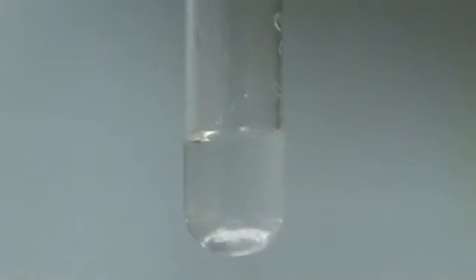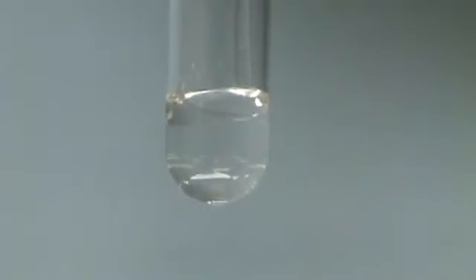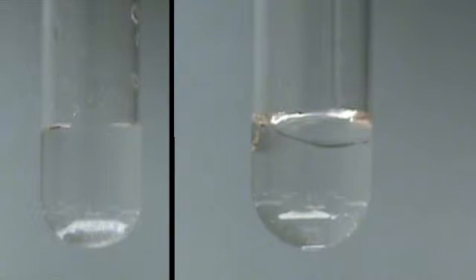If you see a single layer of liquid, the alcohol is miscible in water. If you see 2 layers, the alcohol is immiscible in water. How many carbons does it take to make the alcohol insoluble in water?